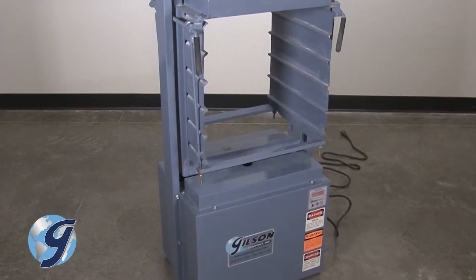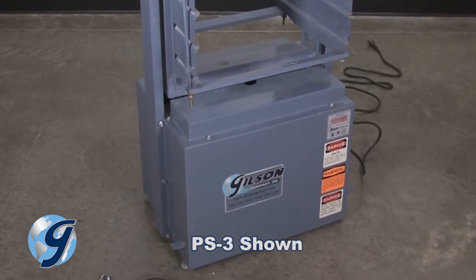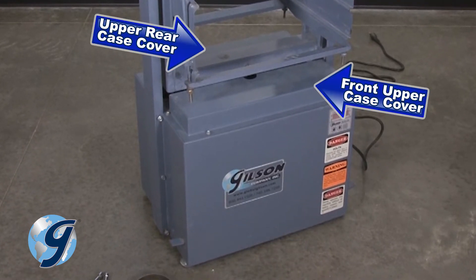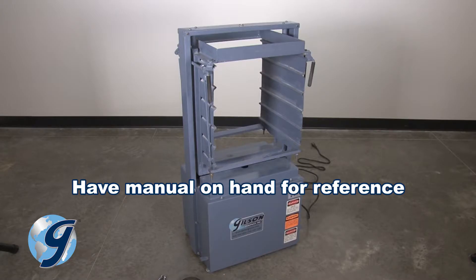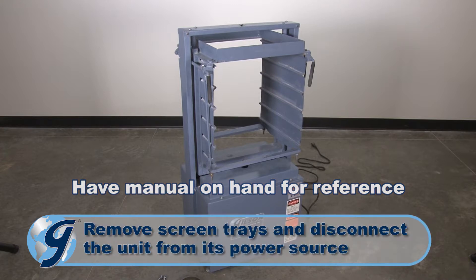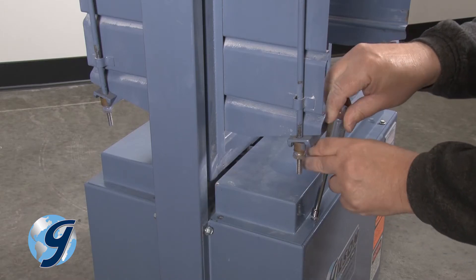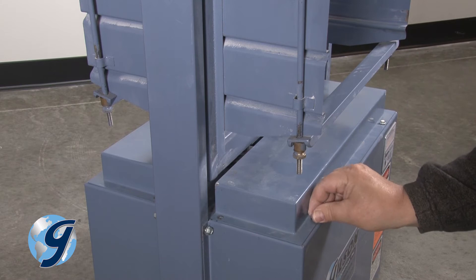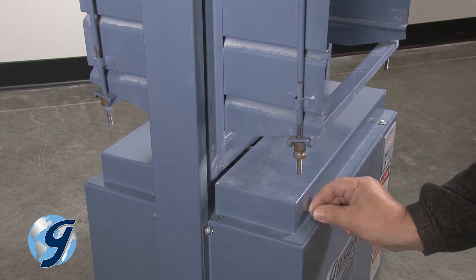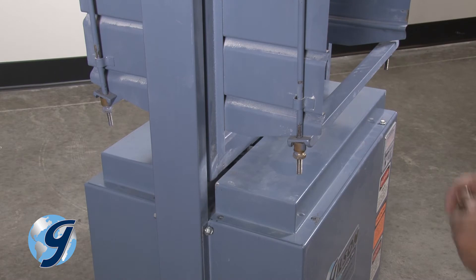To properly position the counterweights on your PortaScreen, you need to remove the four covers of the unit: the front and rear upper case covers and the front and rear case covers. First, remove all screen trays and disconnect the unit from its power source. Please note you can just remove the front and/or rear case cover with the top covers still attached. For this demonstration we will remove each cover individually.